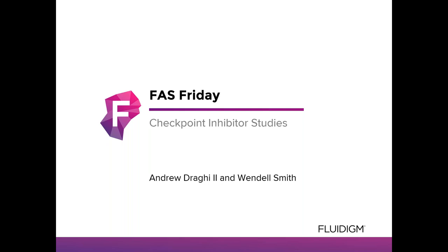In the meantime, we will start by highlighting the use of mass cytometry and imaging mass cytometry in checkpoint inhibitor studies.